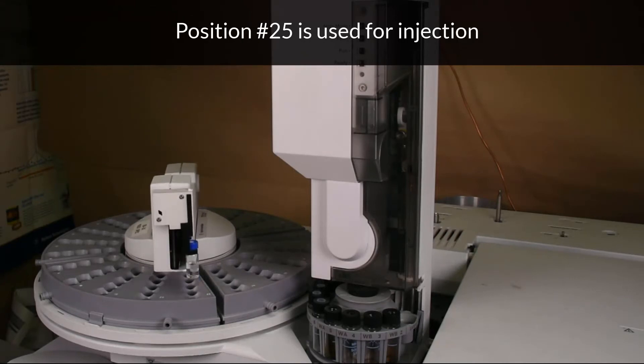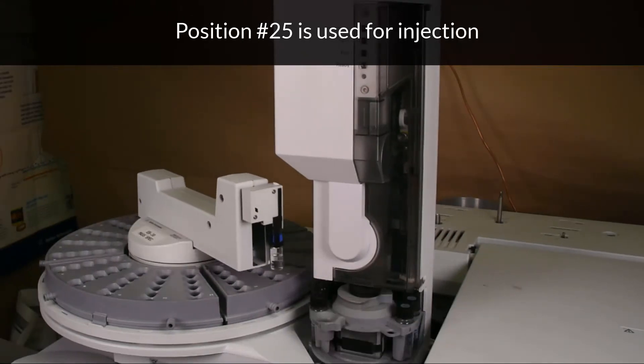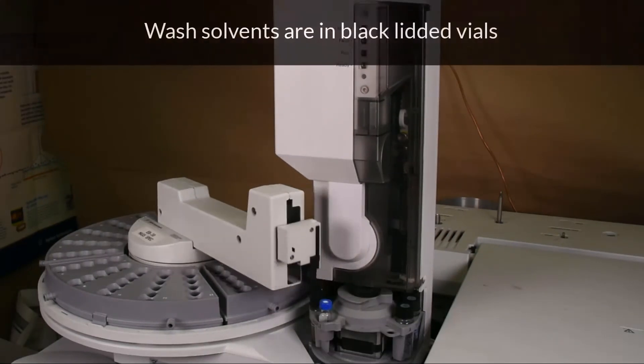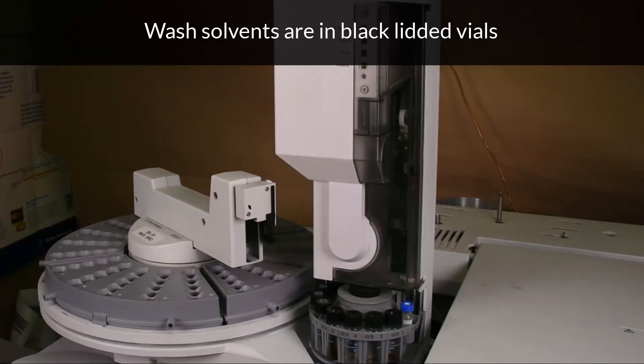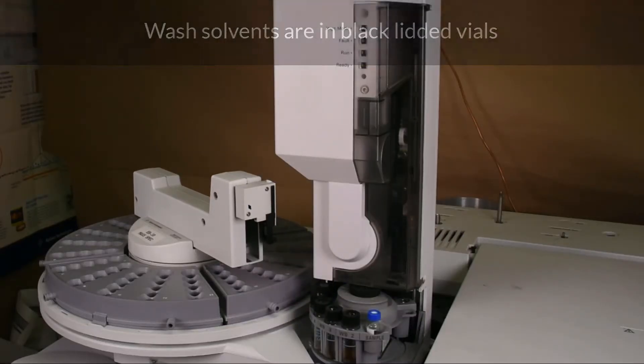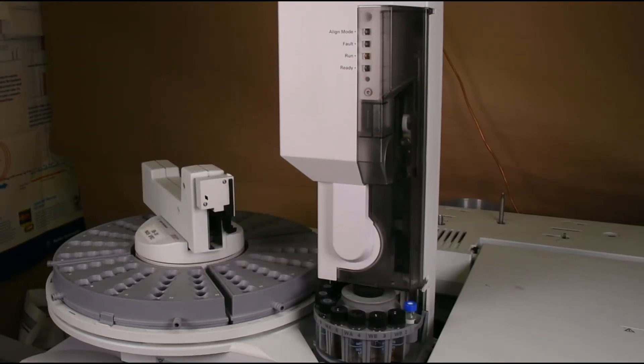The auto-sampler selects a vial and positions it under the injection needle. The auto-sampler proceeds with washing stages before it injects the sample. The needle withdraws sample at set volumes for injection.